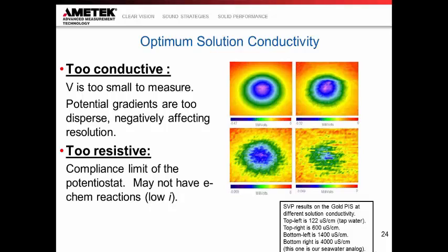So using a more resistive, not DI water, but a more resistive environment, I can increase my V signal, I can keep that localized, I can functionally freeze the corrosion process. So I can investigate it and look at it with the sample being in a similar state at the end of the experiment as before the beginning of the experiment.